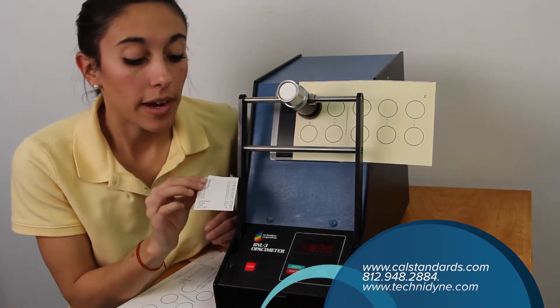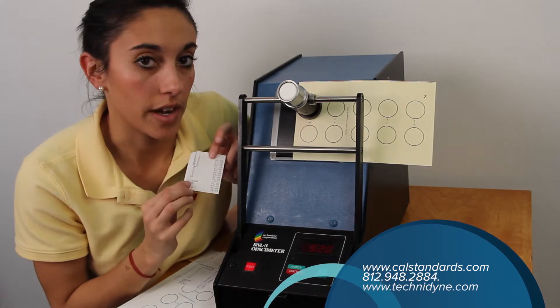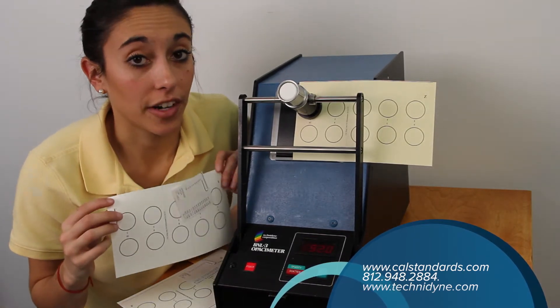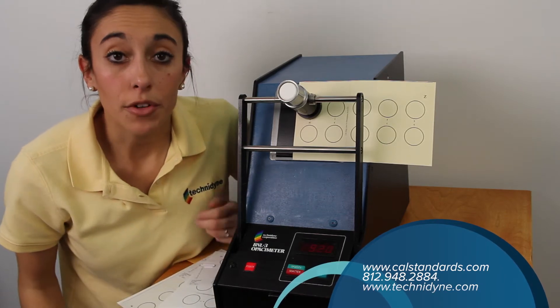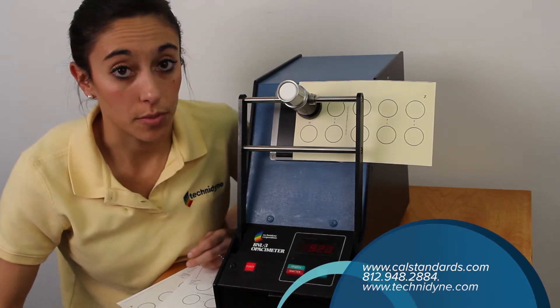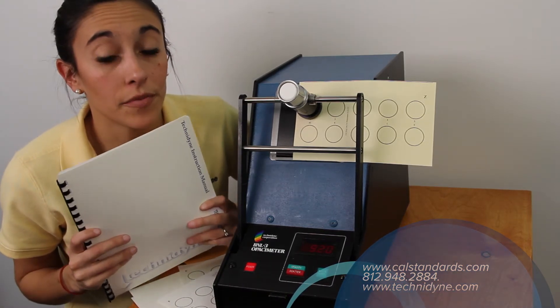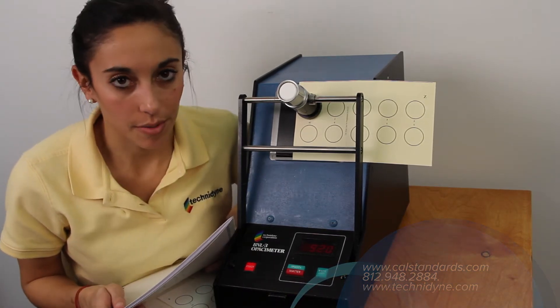That average should be within plus or minus 0.3 of the average from your printout. Follow those same steps for the last two paper verification standards — those averages should be within plus or minus 0.3 as well. If they're not, or if you have any other questions, you can refer to your Technidyne operator's manual, call Technidyne, or check out the website.